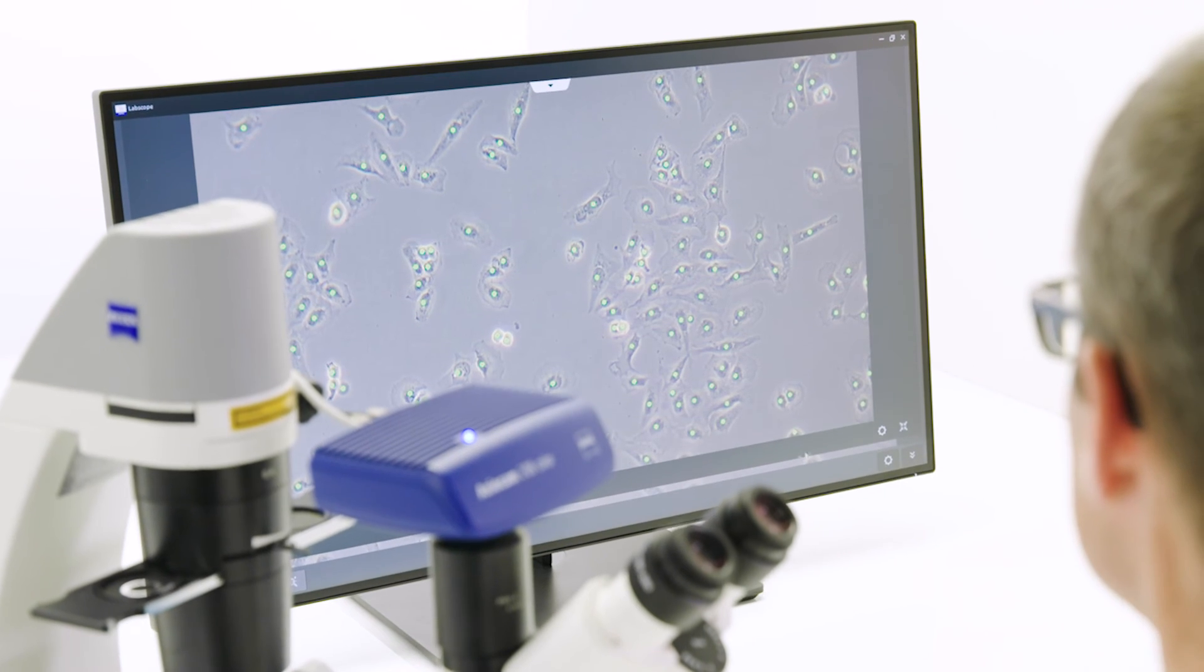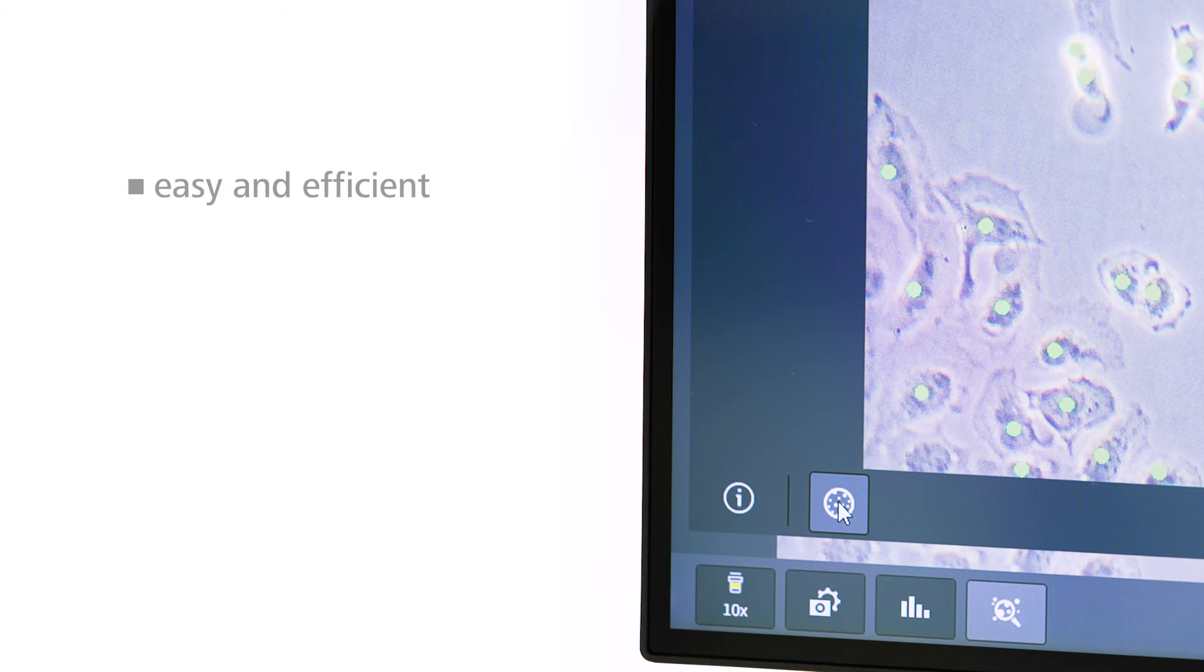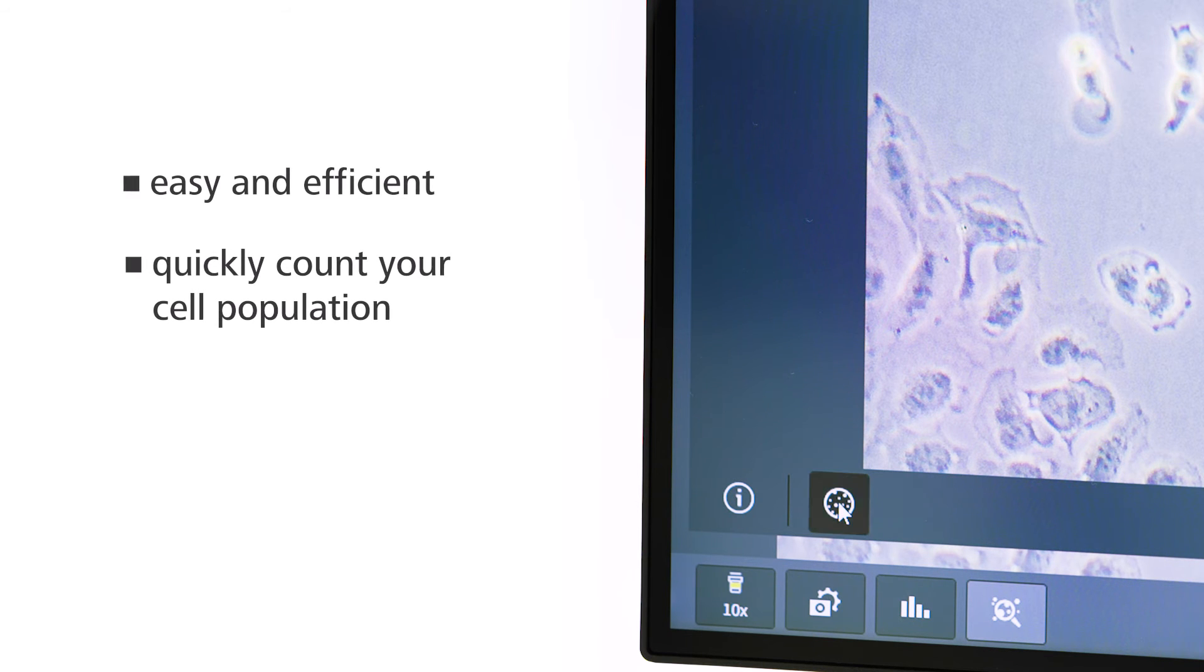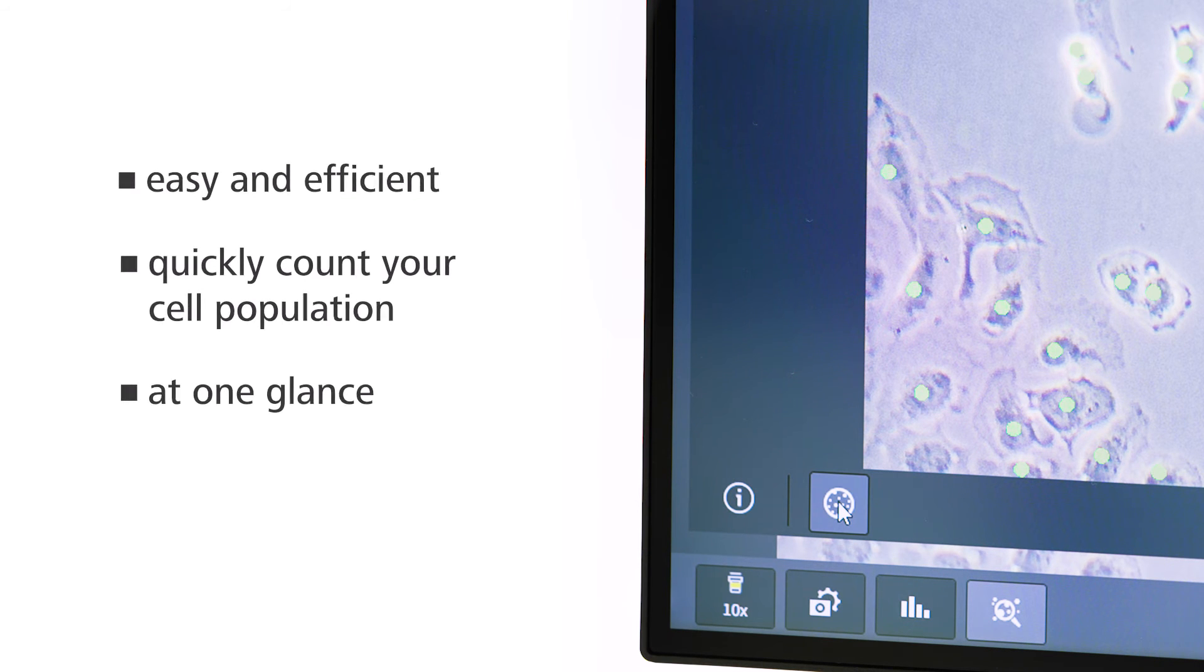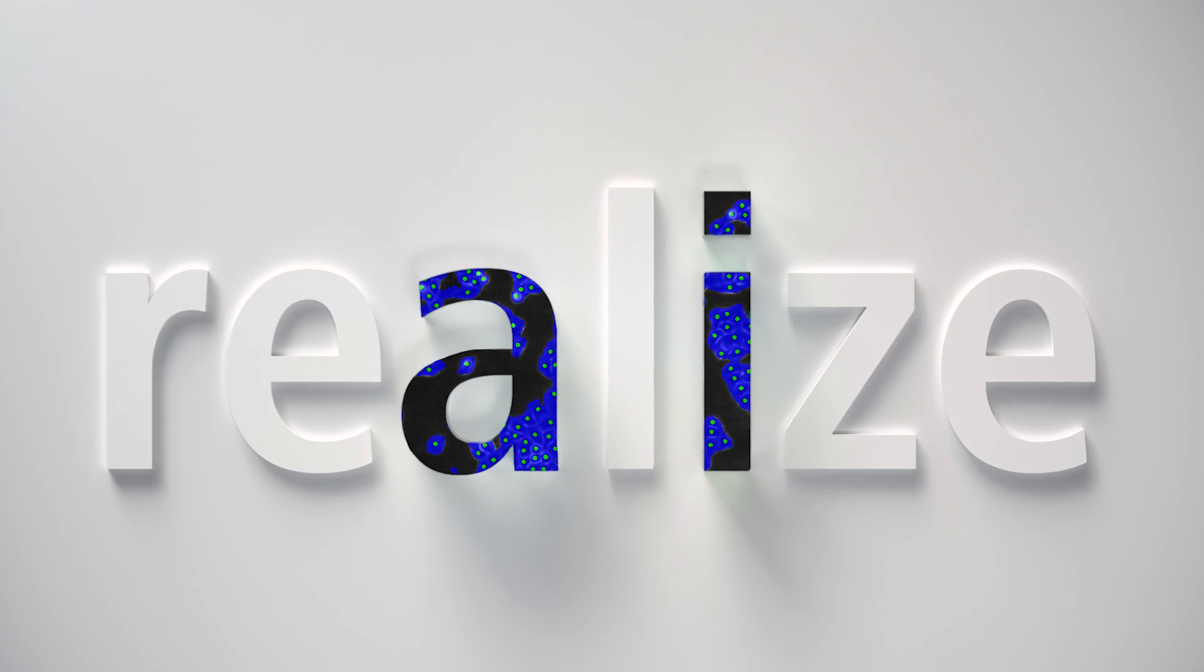With LabScope AI cell counting, you get an easy and efficient way to quickly count your cell population at one glance. Realized by LabScope AI cell counting. For further information, visit our website.